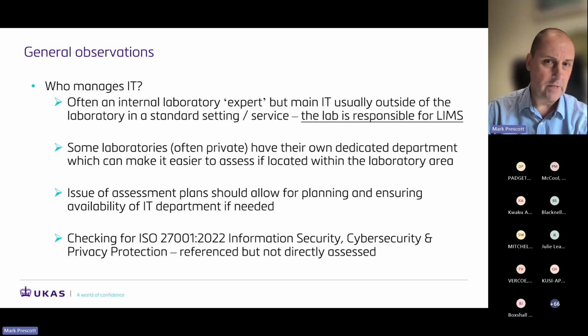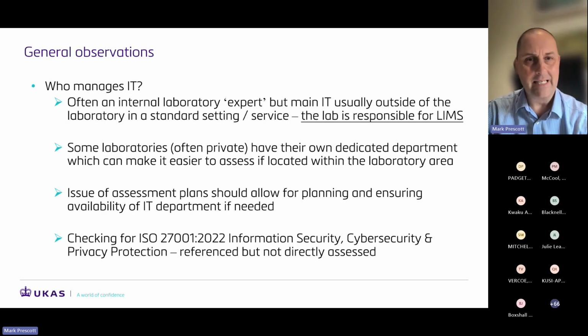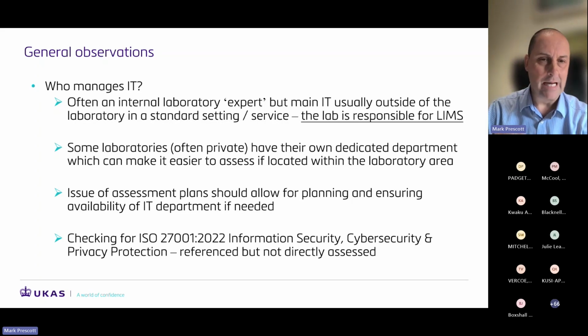There are some laboratory services that have got their own dedicated IT departments. They're often private ones, but I have seen some with a central presence in a standard laboratory. This can make it easier to assess. If the IT department is available and handy, close to the laboratory, that makes the assessment much easier, because we do need to speak to people in IT sometimes, and very often we do turn up on an assessment where it's on the assessment plan that IT is going to be covered.